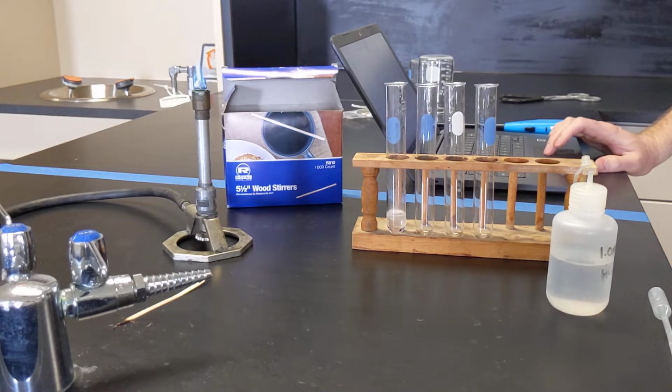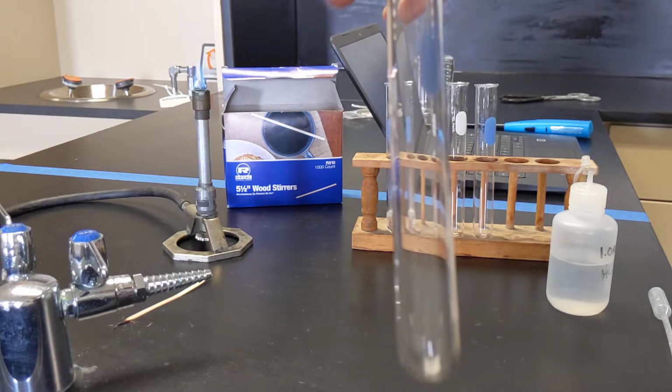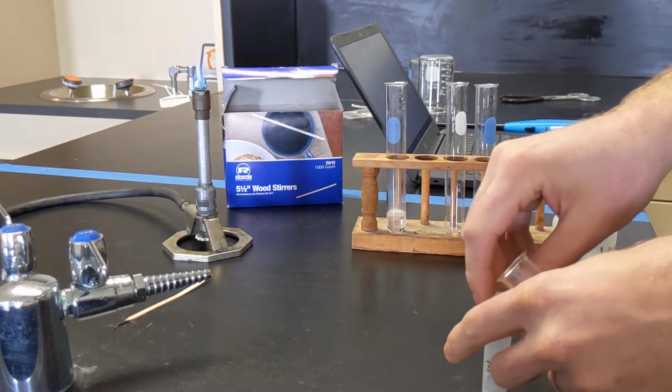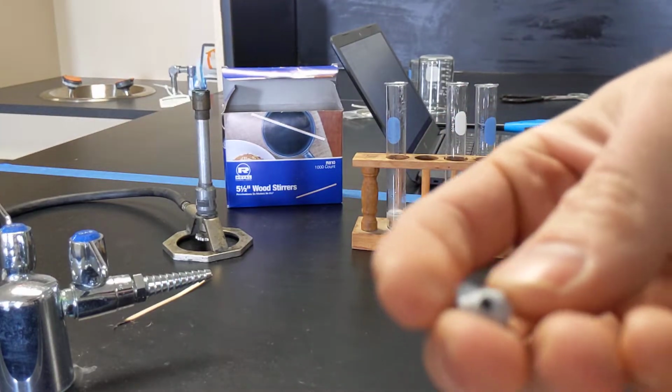Reaction 3, we need to combine zinc with copper 2 chloride, it says. I will use a new test tube. There's nothing in that one. The zinc metal is in this plastic container. It is not as silver or shiny as the magnesium because it reacts readily with oxygen in the air. So it kind of has this white coating on it.